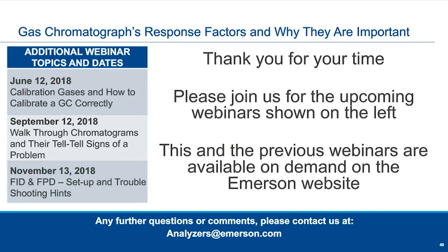So how is the relative response factor different from the ideal relative response? They're calculated the same way. The ideal relative response factor is basically based on your reference or your initial response factor. So they're exactly the same thing. The ideal is just what you expect it to be. Relative response factor is what it actually is when you run your unknown.